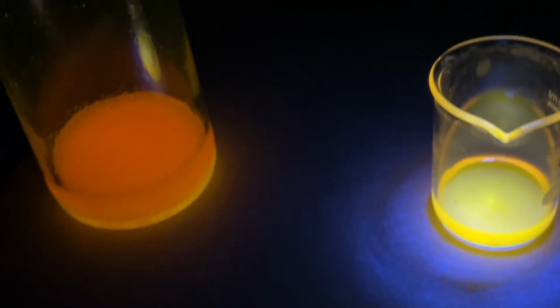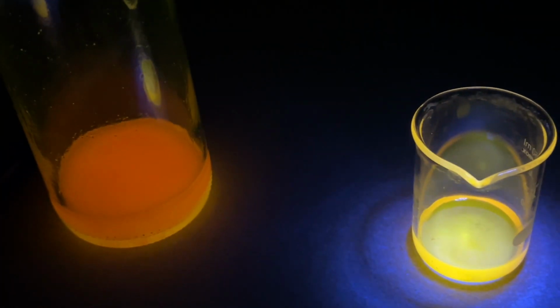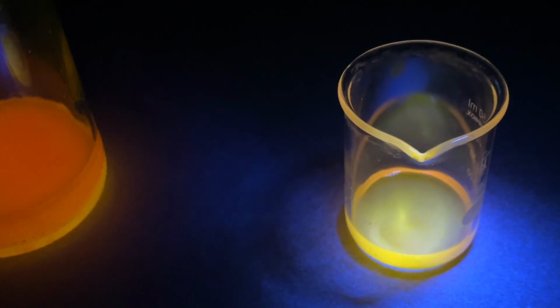And in this other beaker right here, I just have the dye dissolved in some of the solvent, but there's no other agents added to cause it to phosphoresce. But I'm going to use this UV light here and shine it on it, and look what happens. It excites it in the same way that the reactive intermediate generated in this chemical reaction does, and causes it to fluoresce.